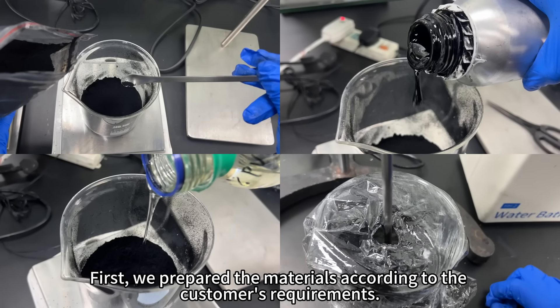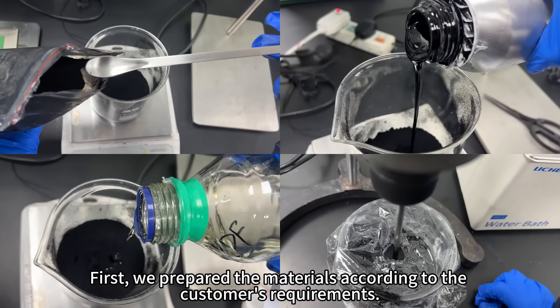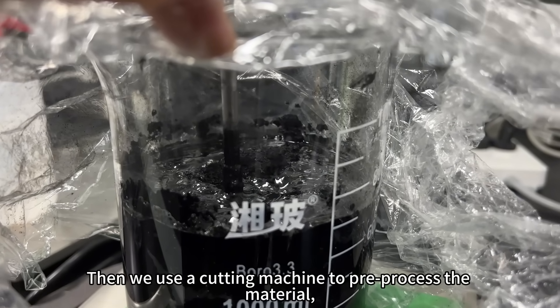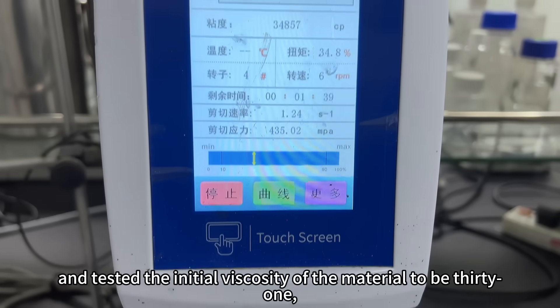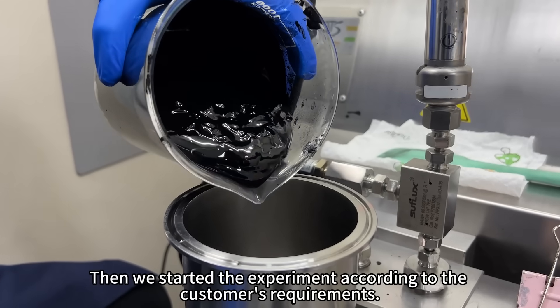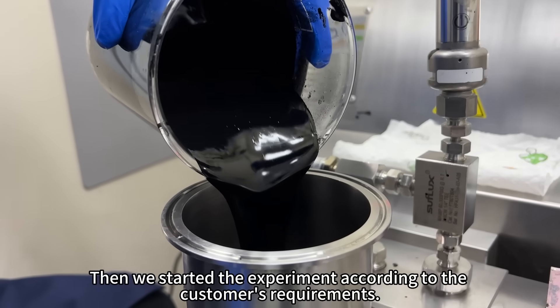First, we prepared the materials according to the customer's requirements. Then we used a cutting machine to pre-process the material and tested the initial viscosity of the material to be 31. Then we started the experiment according to the customer's requirements.